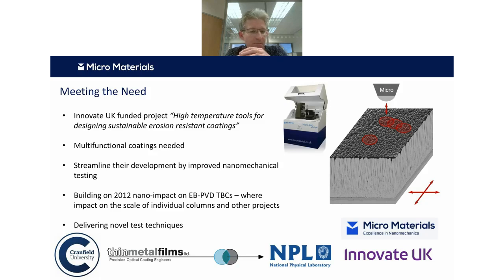This is quite a challenge from a coating development point of view, because there are lots of compositions you could try, and it's very expensive and time consuming to evaluate their properties. So what we really would like is to develop novel small-scale test methods that allow us to effectively evaluate and screen potentially useful compositions for further work.